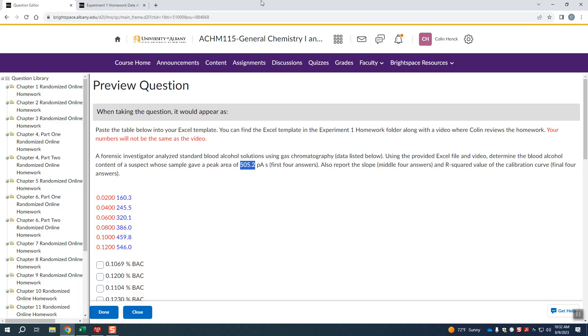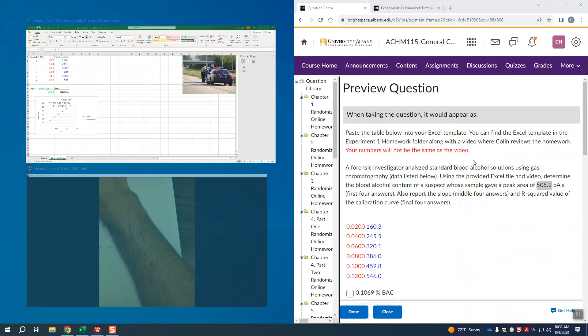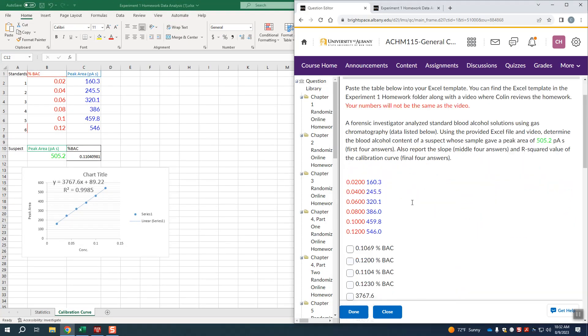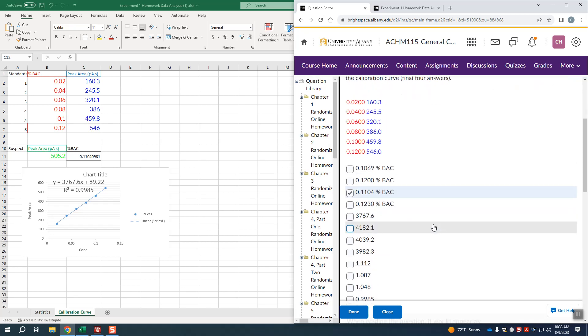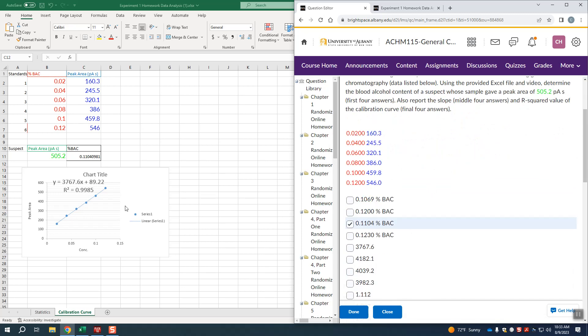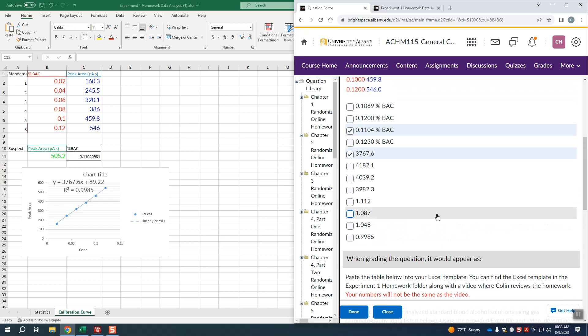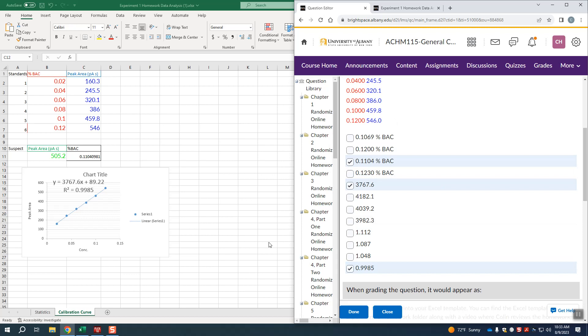If we click down over here, I'm gonna make this half screen. It wants first the blood alcohol content, which is 0.1104, which is right there. The other one is the slope of the line, remember y equals mx plus b, this is the slope, so 3767.6, and then finally the r squared, which is 0.9985, which is that one right there, and you can select those values. So that is basically how it works.